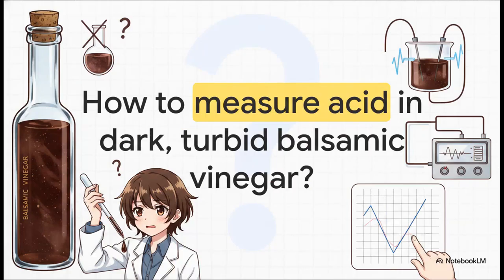Okay, let's dive into this with a super practical problem. Imagine you've got a bottle of dark, rich, totally turbid balsamic vinegar, and you need to know its exact acidic strength. Now, traditionally, chemists use a chemical indicator that magically changes color to tell them when an acid is neutralized. But here's the catch. If your liquid is already pitch black or just incredibly cloudy, how can you possibly see a delicate little pink color change? Well, the short answer is you can't.